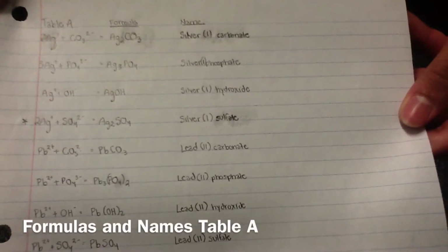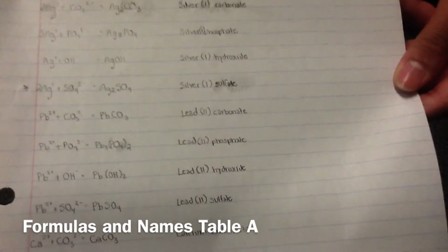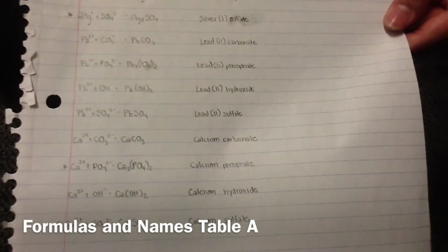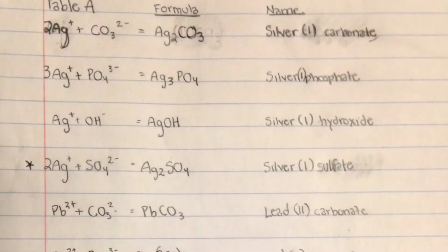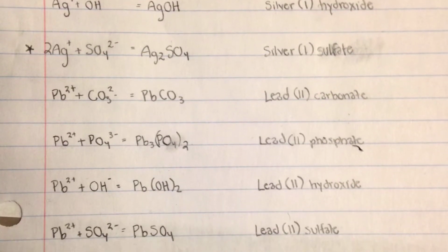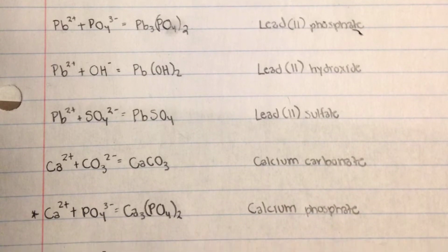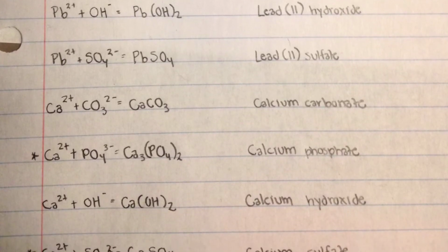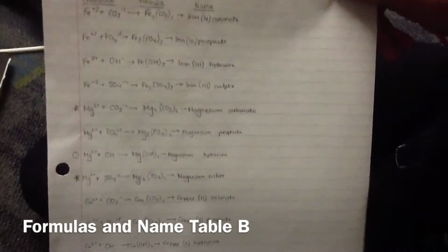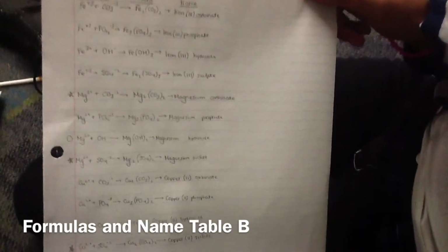The formulas and names for the compounds created in Table A are listed below. The ones with the stars did not form precipitates. This is all the formulas from Part B. All the formulas which are starred did not form precipitates, and the one which has the circle next to it, we cannot tell whether a precipitate formed or not.